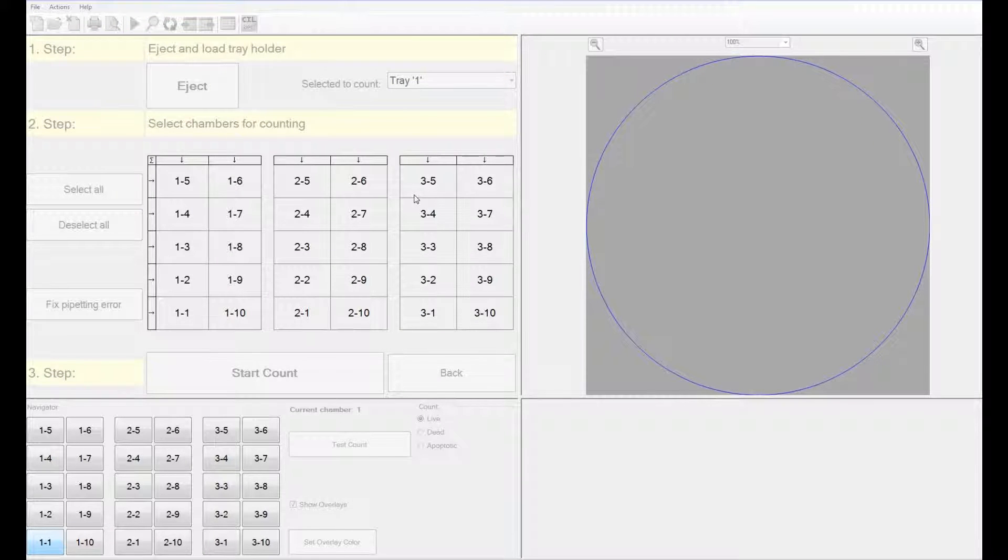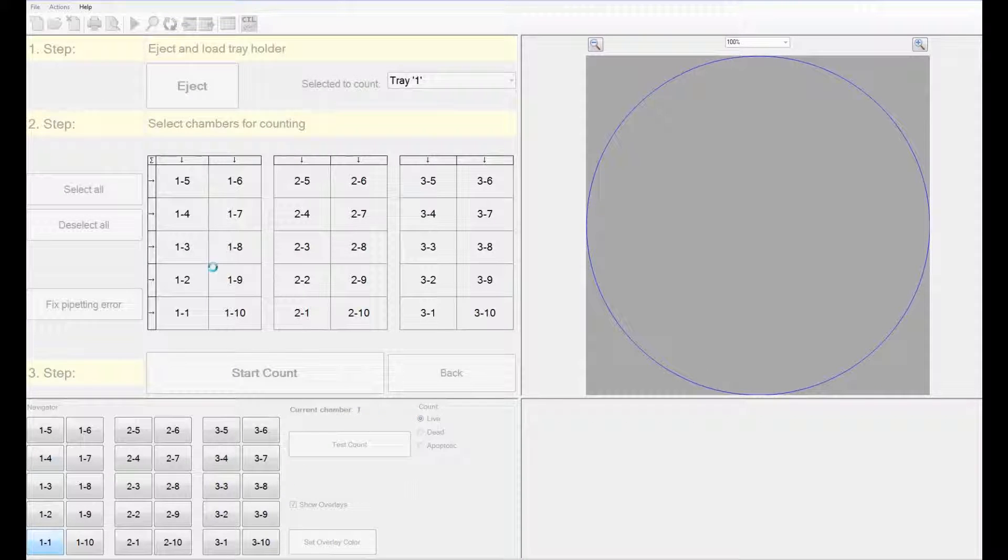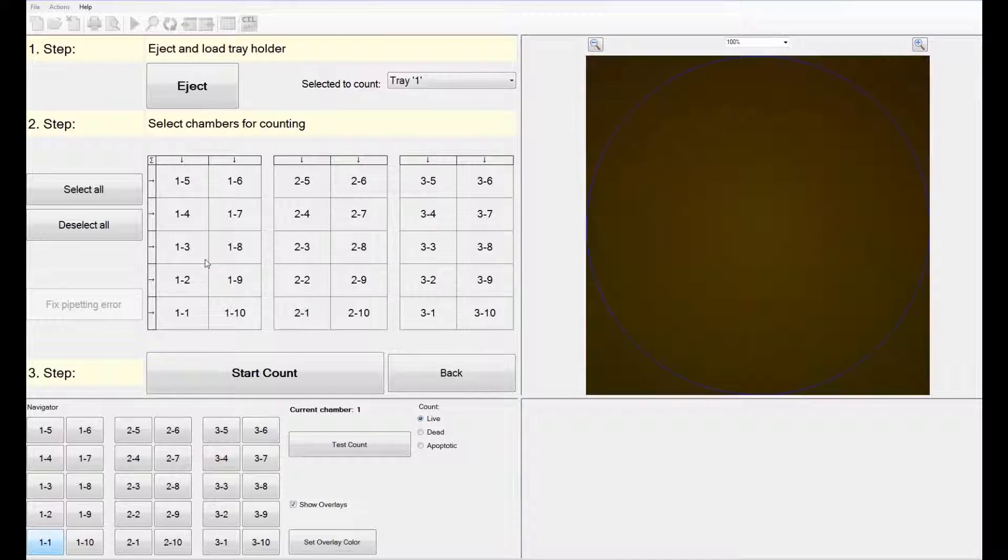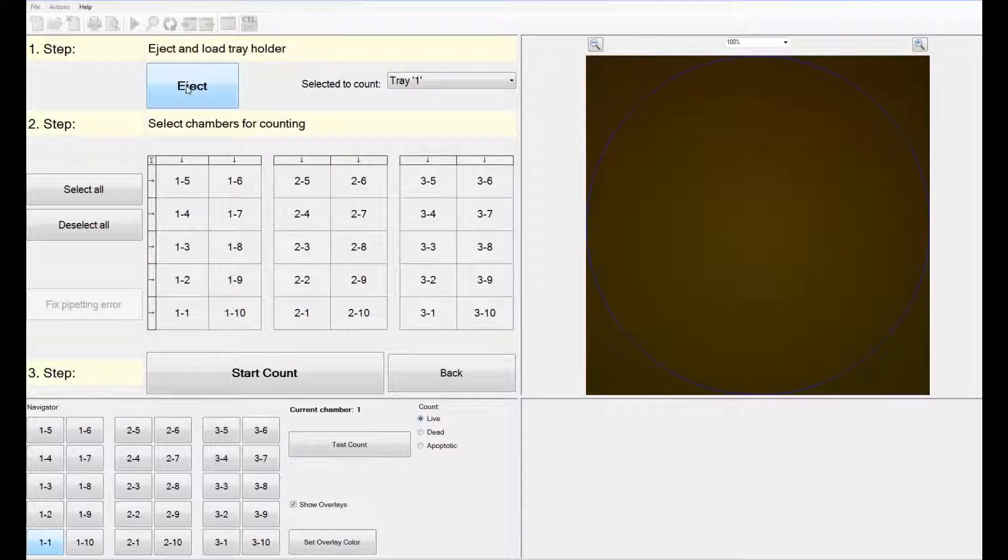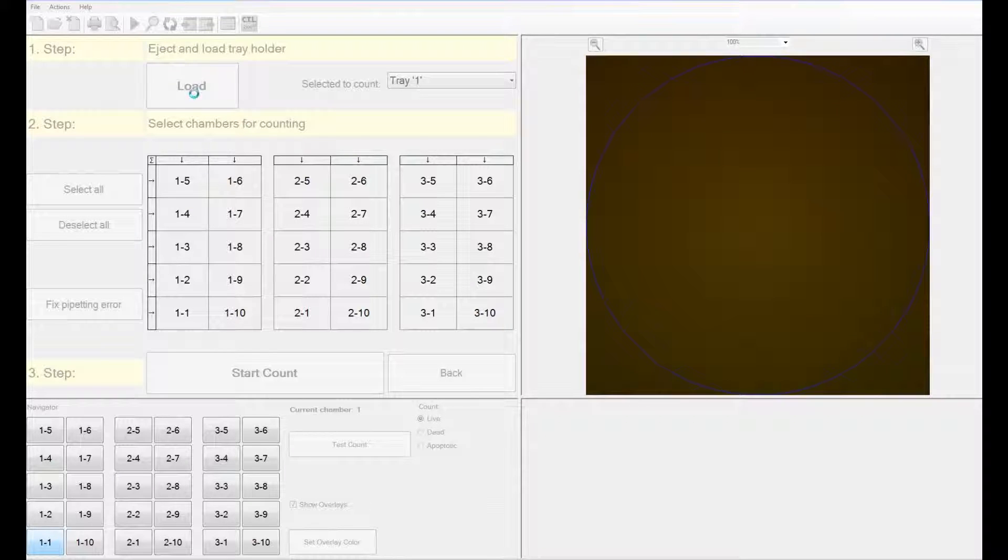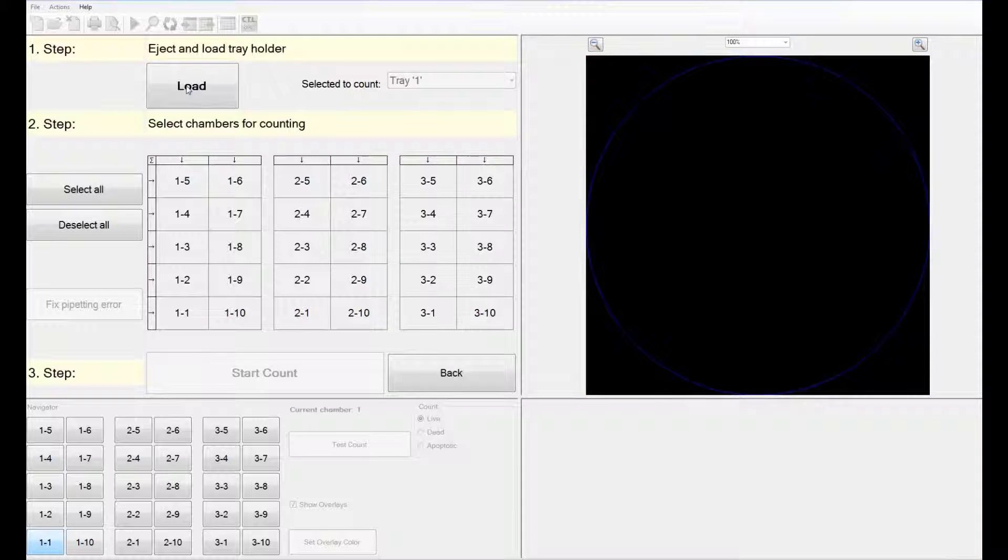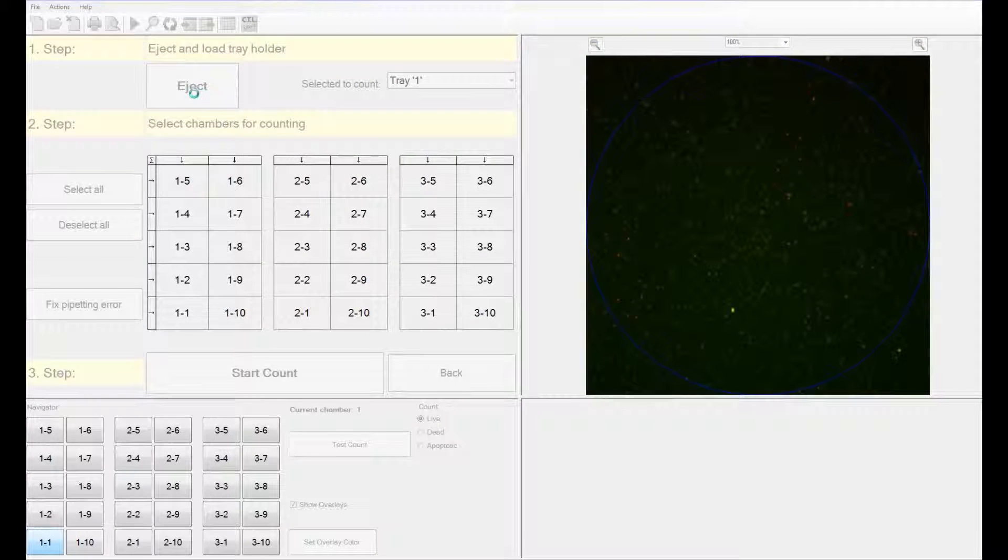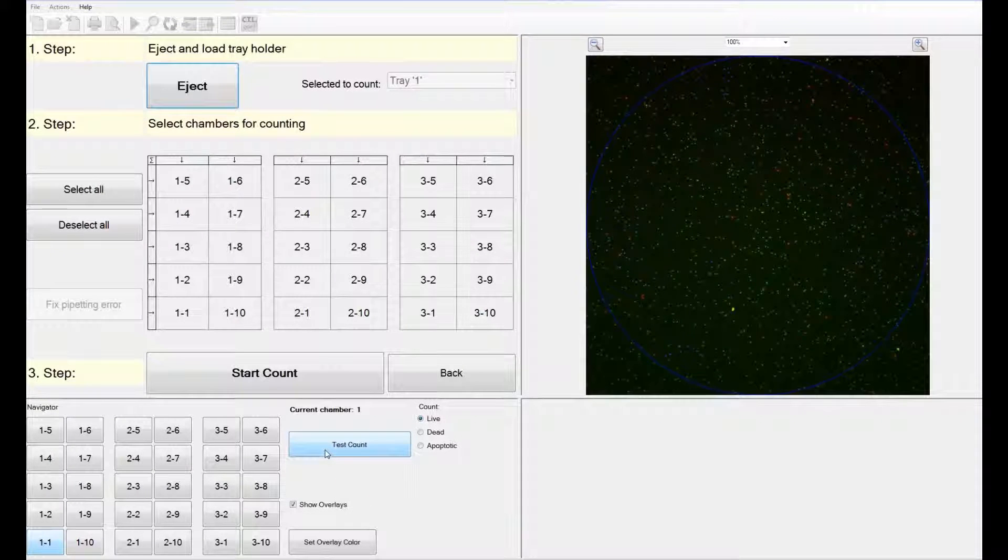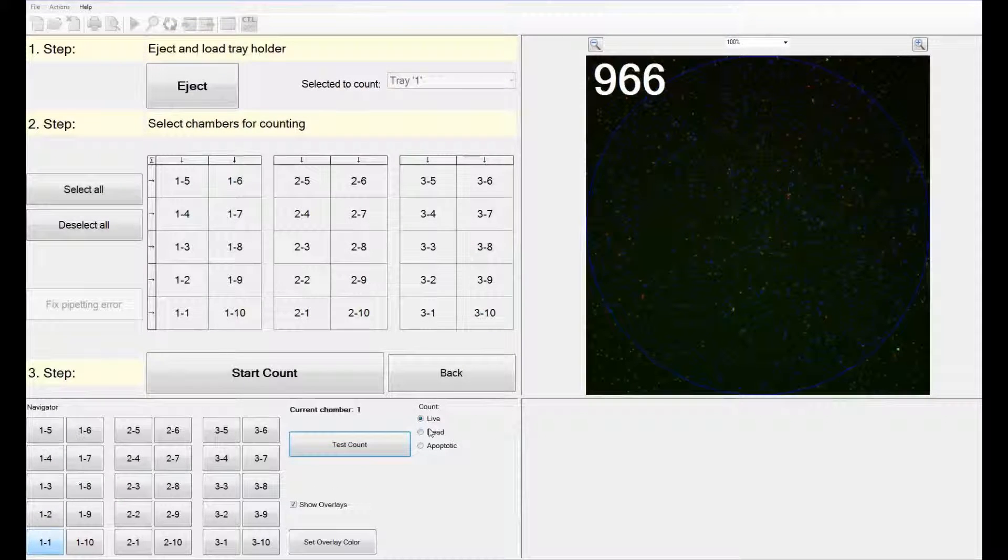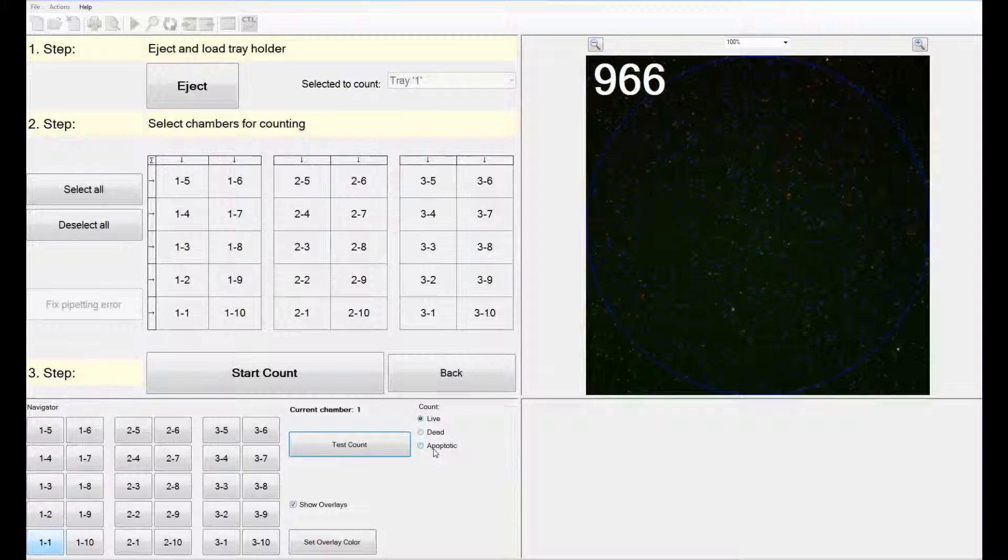After setting the parameters, the software opens a window that launches the navigation and the selection of wells window. The software automatically starts with position 1 of the first hemocytometer chamber. Before starting your counts, you have to eject the plate holder and load your hemocytometers onto it. You can, at any time, test the counts of your samples by clicking on the test count icon.